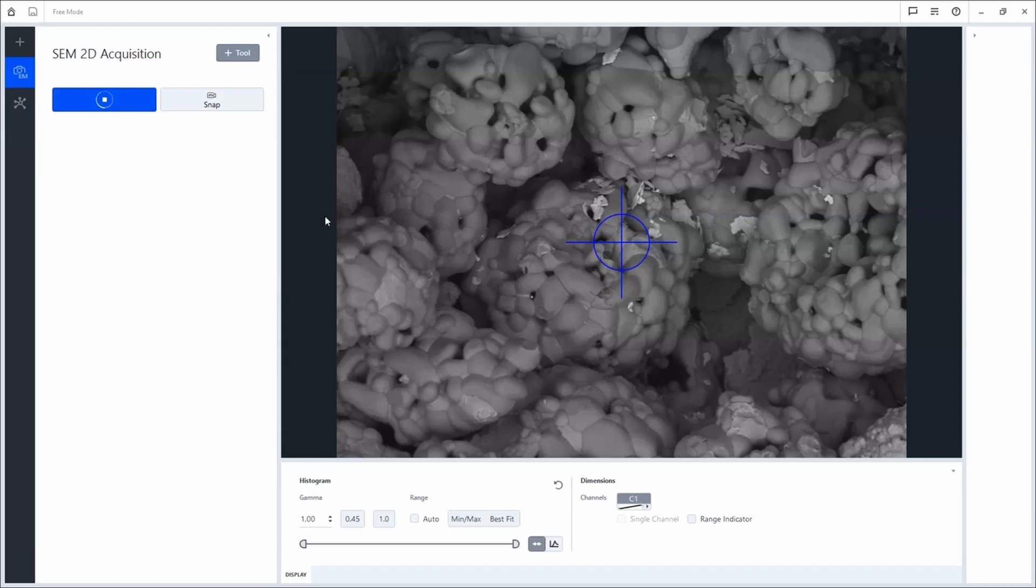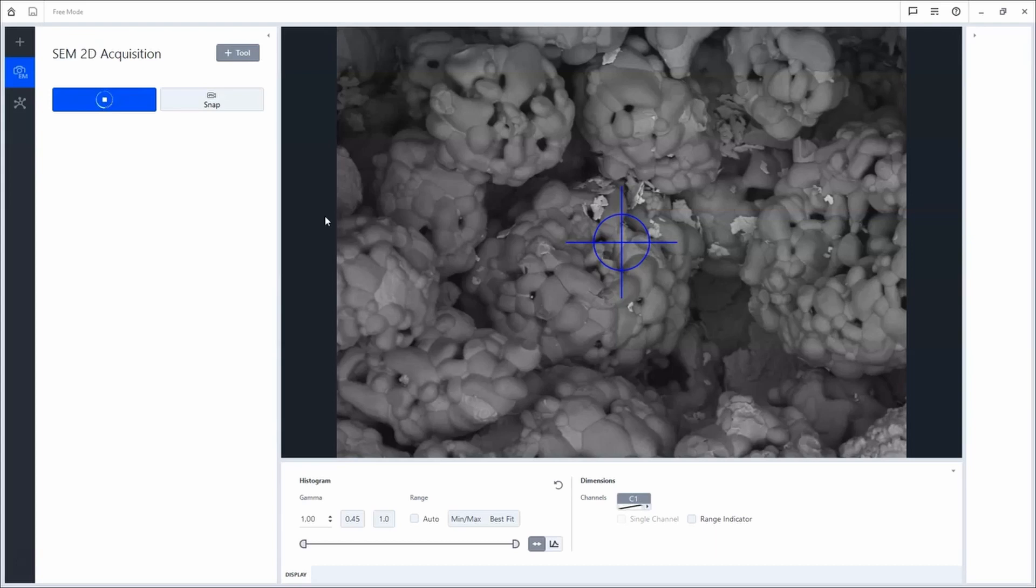Within the acquisition tab, you can easily do imaging as you are used to. Here you see a powder-like sample on an aluminum stub.